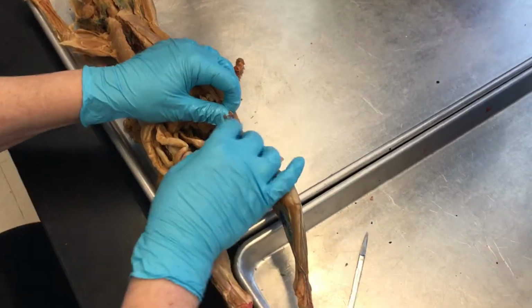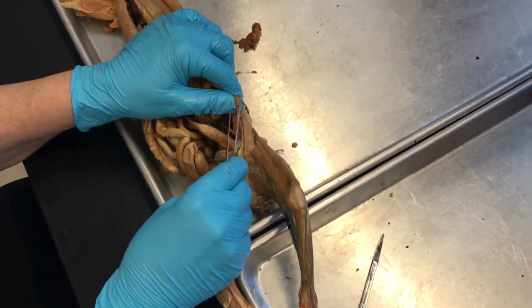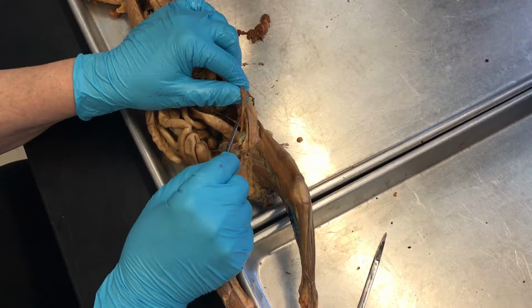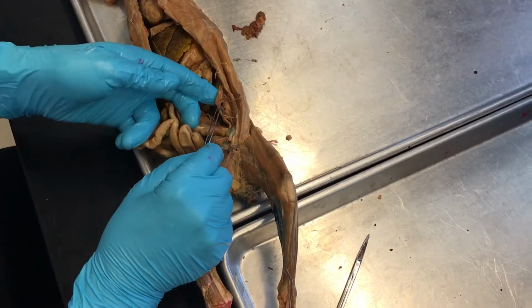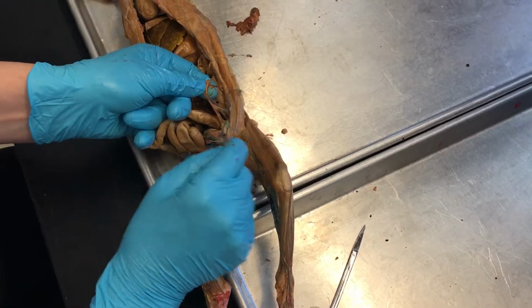Luckily, we have already taken the ovary and dissected a little bit, so you can see how it looks like a gland right there. And this tube is one horn of the uterus. To get the fallopian tube, we have to go to this area that was dissected out.